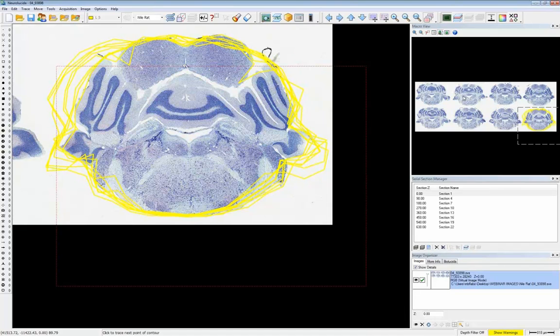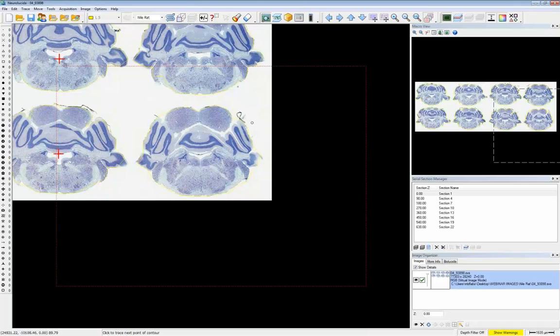the serial sections. So in one mouse click, I can toggle between a traditional view relative to where the image data is actually located and an aligned view, which would be helpful for us to take this data to a 3D visualization method. This hotkey to quickly snap the contours to the registration of section 1 is available in version 11. That will certainly make people's lives easier.